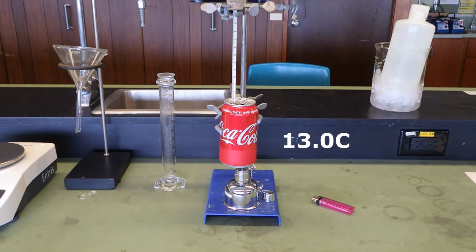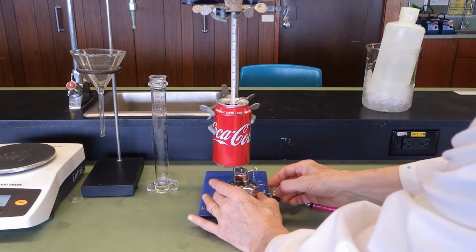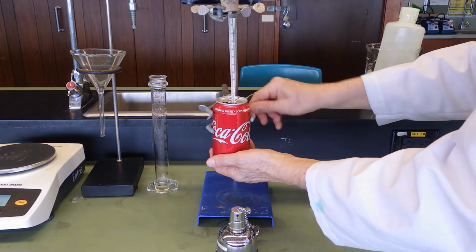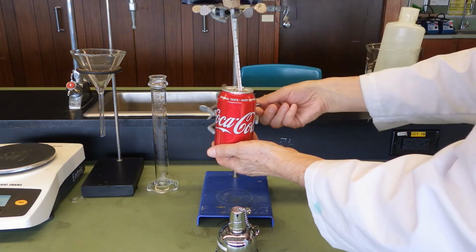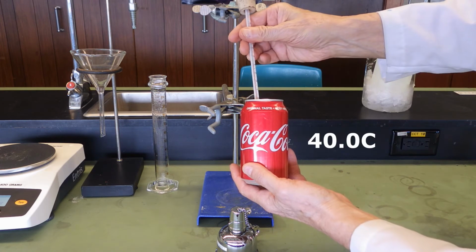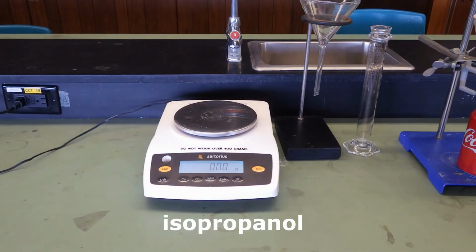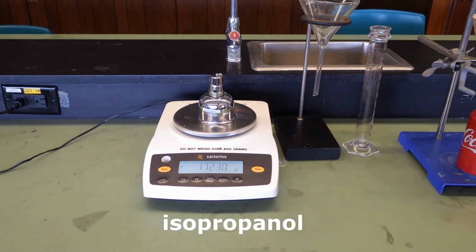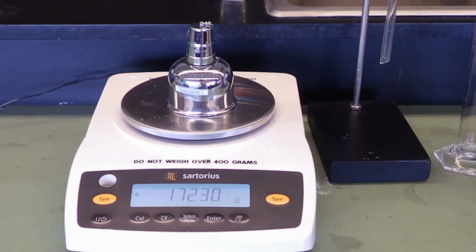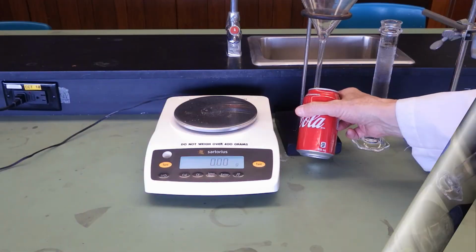Our starting temperature is 13.0 degrees Celsius. We'll let that heat for a while. Okay, so the temperature has risen. We'll shut the lamp off again. Once again, we want the maximum temperature. Looks like 40.0 degrees Celsius. And we'll weigh the lamp for isopropyl alcohol to see how much has been used: 172.30 grams.